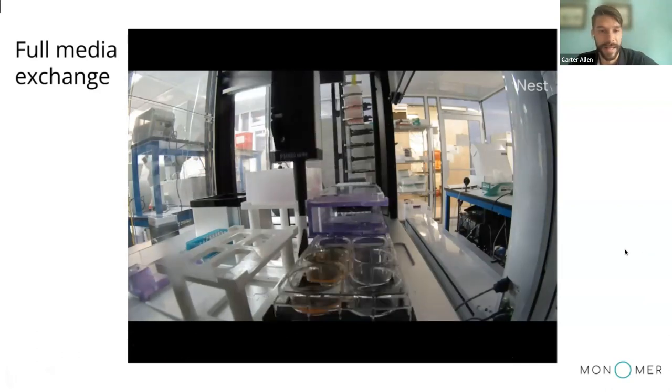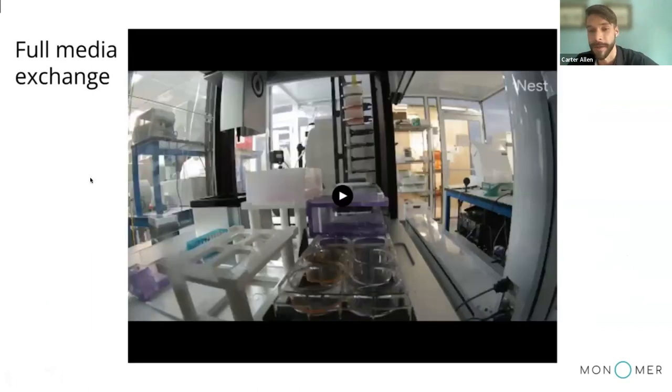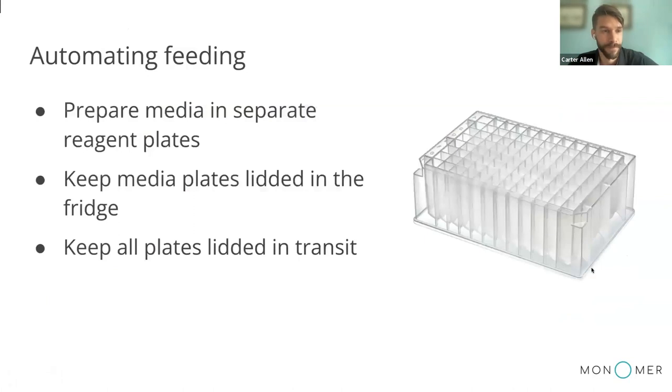All right. So I'm going to go back a slide before the video. The other suggestion that we have is that we keep media plates lidded always, other than when they're on the deck under a HEPA filter. That's how we maintain sterility in our systems, using that Opentrons HEPA filter as the only location where the plates are unlidded.